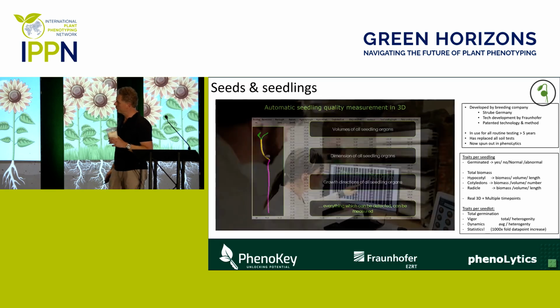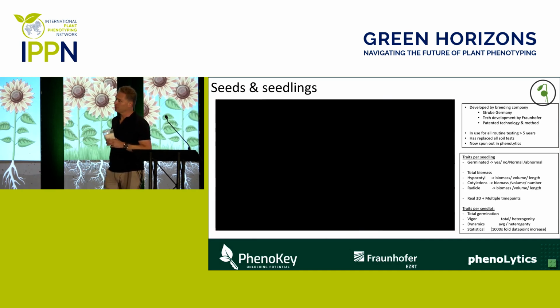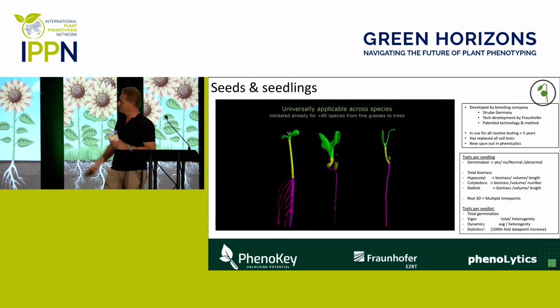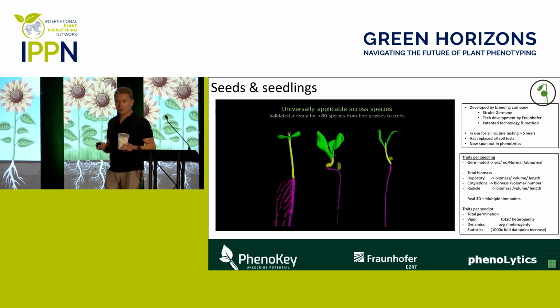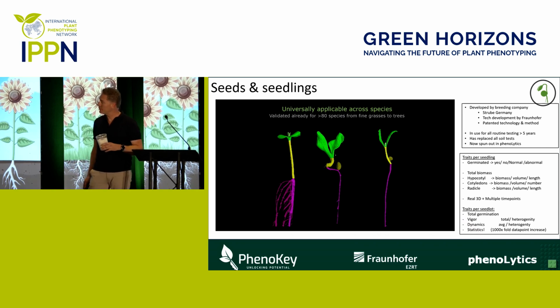The paper is removed, the seedlings are isolated, and you have 3D ground truth models of every individual seedling that's in the pot. Those seedlings can be segmented, all the organs are identified: roots, cotyledon, hypocotyl. From every element you know the biomass and the length. When you have multiple time points, you also know the dynamics. So pretty powerful.